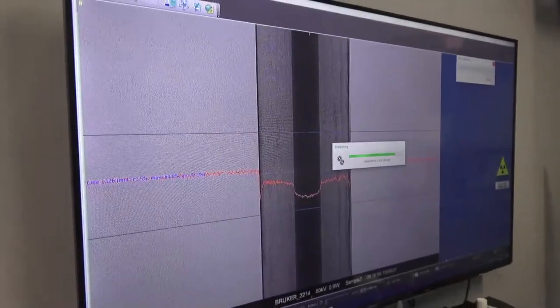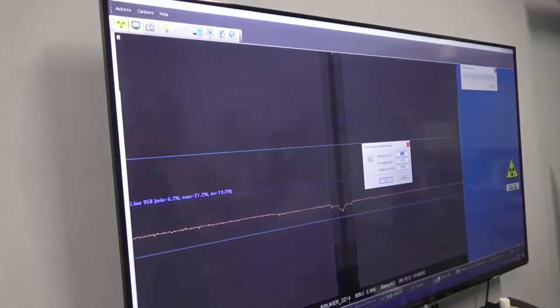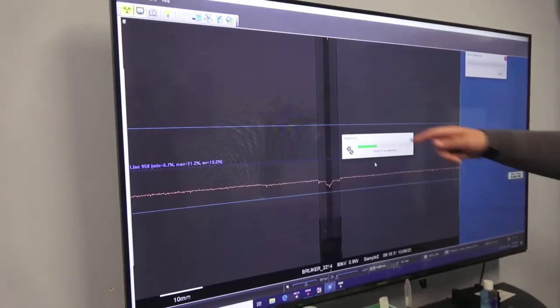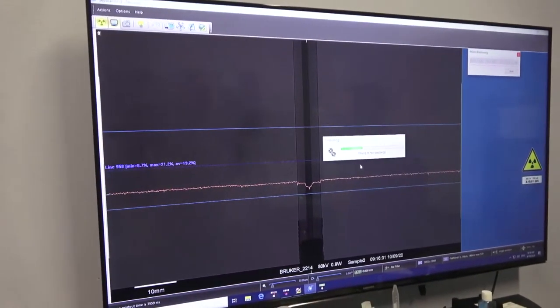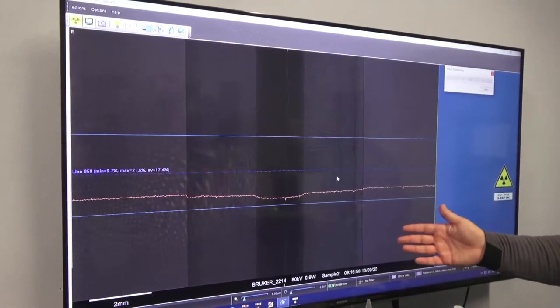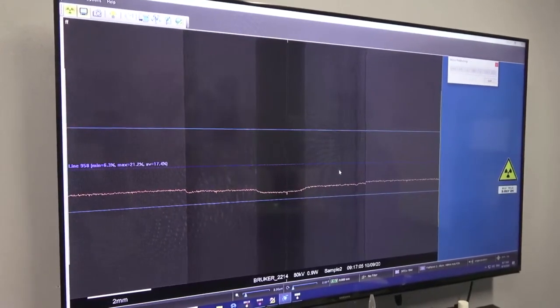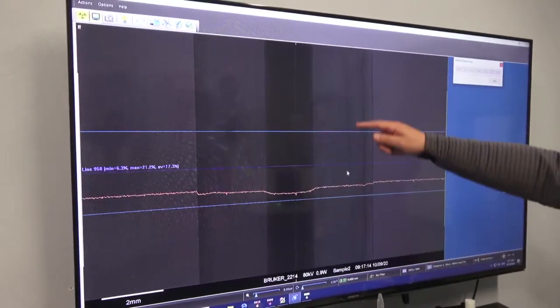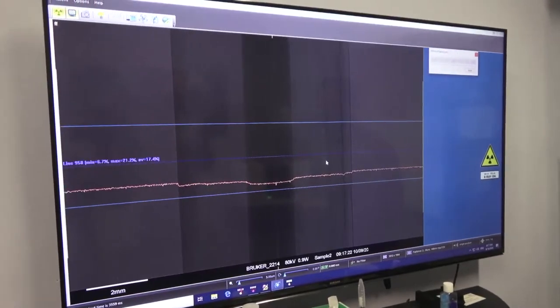Let's start with a projection of the pencil in a lower resolution setup. Here we're looking at the pencil. The system default is 33.9 micron resolution — let me pull that up to say five microns. You can see the layer on the edge, which is probably the paint. You can see the paint, the lead itself, and down at the bottom a little bit of the metal that contains the eraser. This 2D image is a single radiogram. To collect a full dataset, you'd take hundreds or a thousand of these to create a full 3D reconstruction.